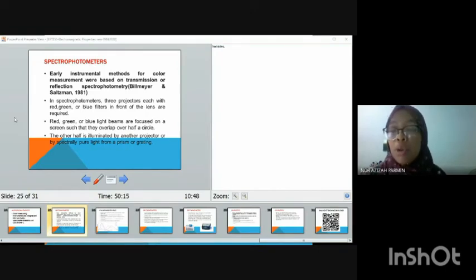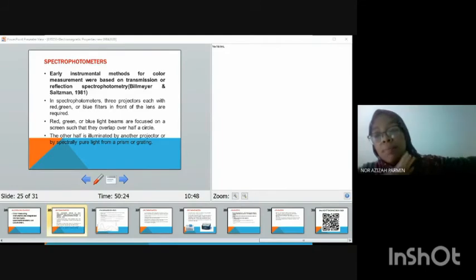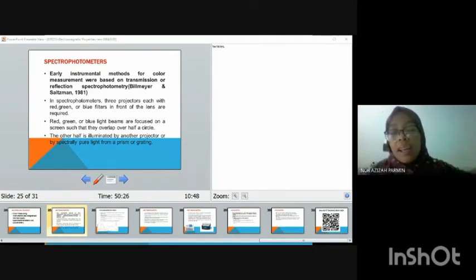Okay, yang kamu tengok in your lab tu dah the new teknologi terkini. So dulu kalau spektrofotometer ni besar, okay, dia dah jadi bentuk benchtop, bentuk yang kecil yang kamu ada juga sekarang yang boleh bawa pergi infield. Benchtop tu still tak boleh kira besar lagi kan. Ada yang size mini, size portable. Tapi agak mahal untuk dapat ni. Okay.